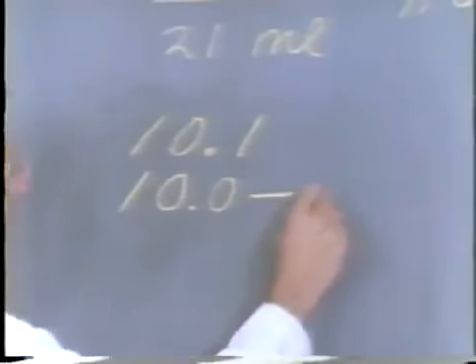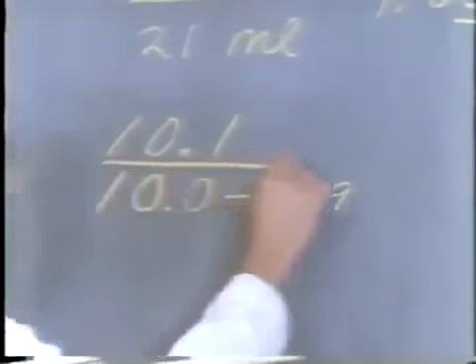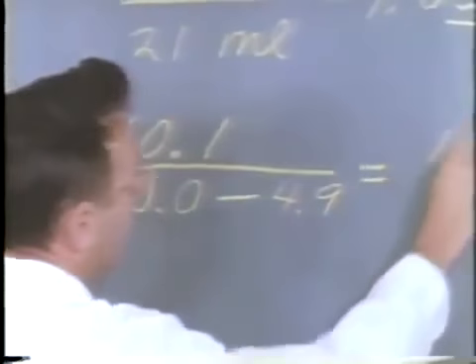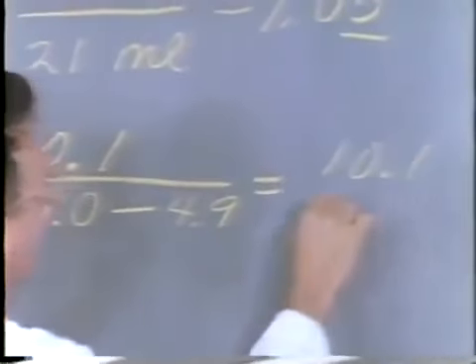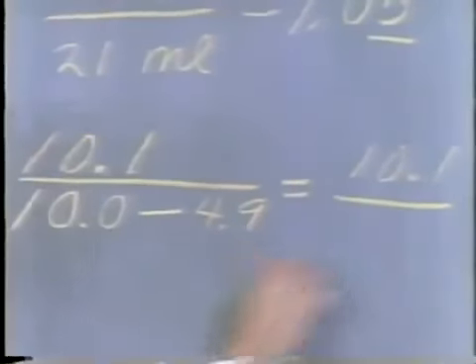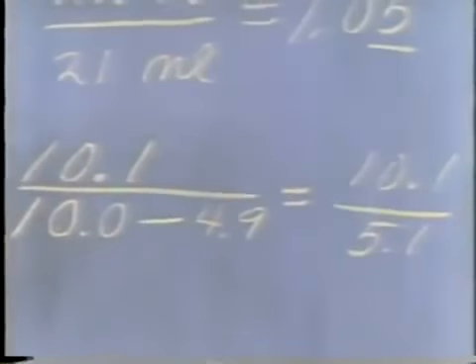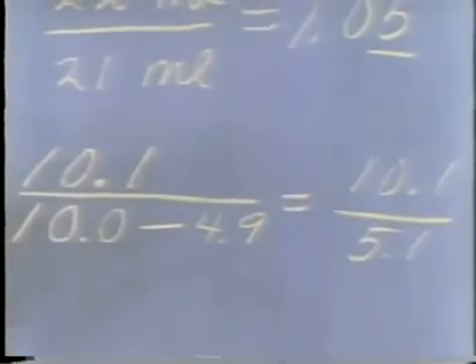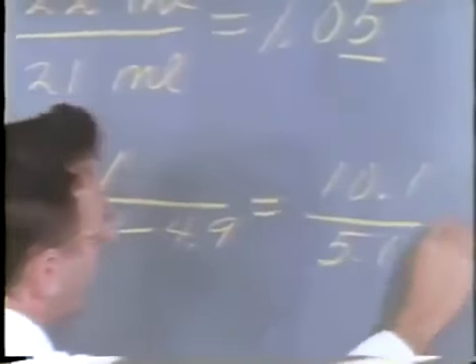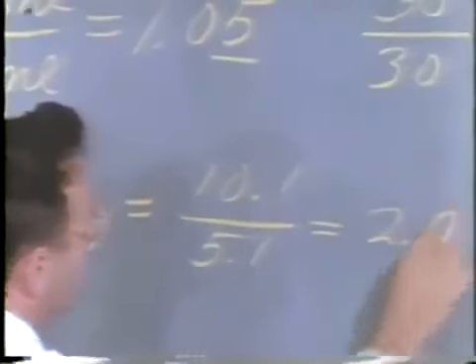Apparently, only a part of them was consumed. The volume ratio can now be calculated. Presumably, all of the hydrogen was used, whereas the difference between 10.0 and 4.9, 5.1, tells how much oxygen was used up. The volume ratio is 10.1 over 5.1, 1.98, or 2.0.